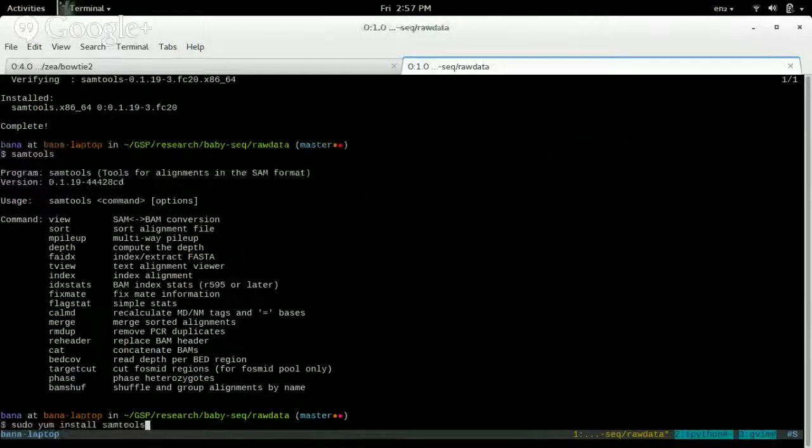But if you noticed, I had to use this sudo command, which I don't know if you saw on linuxcommandline.org or commandline.org, if they have it, that sudo means superuser do. So do something that can or will affect the whole system.